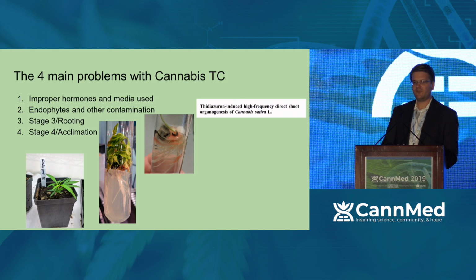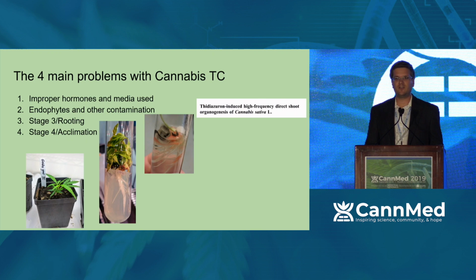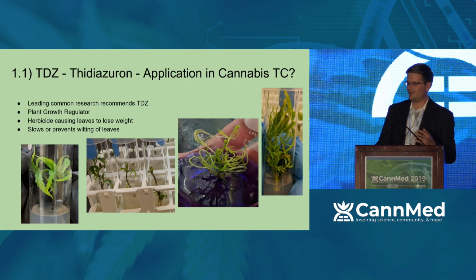The improper hormones. Every time I have looked and read a research article online about cannabis tissue culture, I see TDZ as the main ingredient. So we've got to talk about TDZ here.